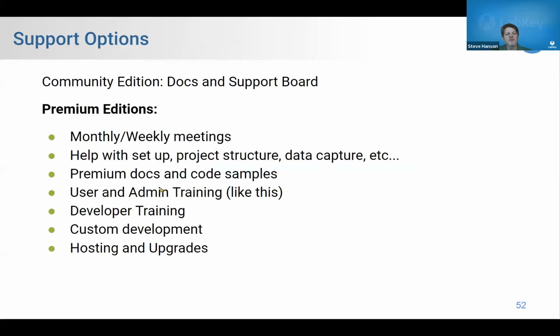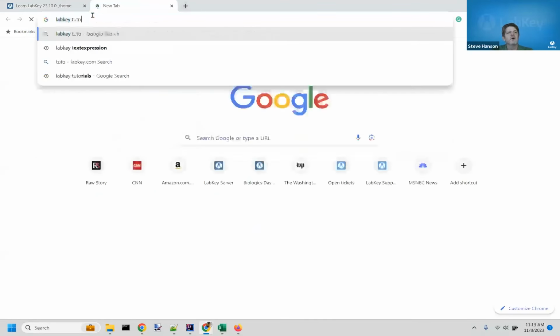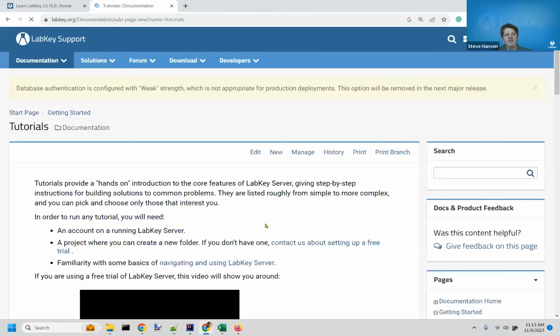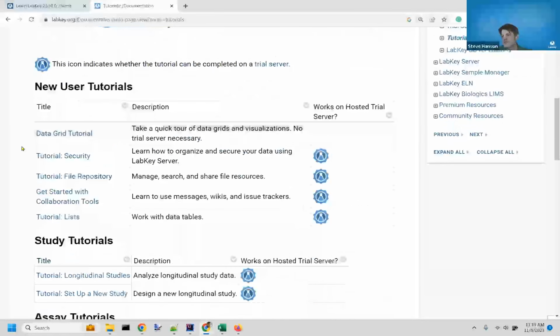Another great option is to get started with the tutorials. Right here on the main docs page, on the main tutorial page, you can see there are all of these different step-by-step tutorials.